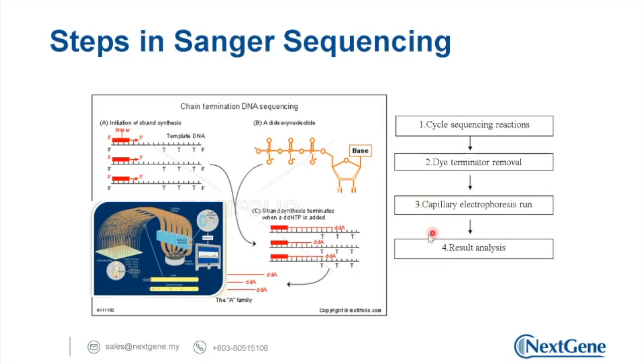Okay. So next, the fragments going through the capillary electrophoresis, we will detect the signal produced by those fragments.